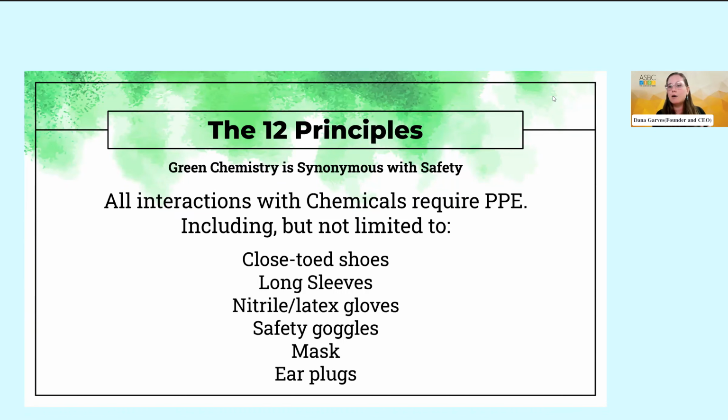And lastly, I think our industry doesn't spend enough time discussing hearing loss and hearing damage that can happen in high production facilities. I know that when I have my 3 centrifuges going and the sonicators, it sounds like a runway in here. So I like to think that earplugs are something that we're going to be seeing more of as far as safety goes within the chemistry lab.